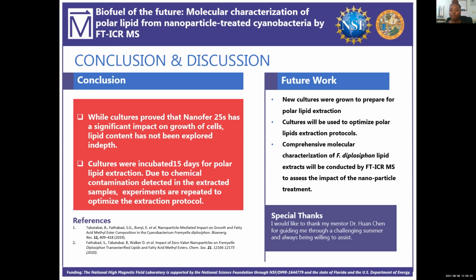Future studies will involve looking further into polar lipid extraction, optimizing our polar lipid extraction protocol, and then comprehensive molecular characterization of F. diplosiphon lipid extracts will be conducted by FTICR-MS.